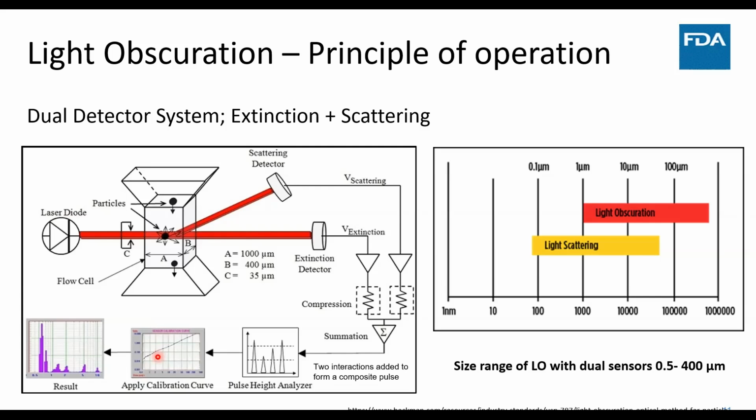The last thing you could also think about here is, can we really count every particle that is going through our product? That is called the counting efficiency. Usually you want to have a system that can get at least about 90% of the particles that go through the system. I brought this up here because I believe that really understanding how the system operates makes it easier to understand or deal with most of the challenges we would see when it comes to the data or the results we get from companies when it comes to some of these instruments.